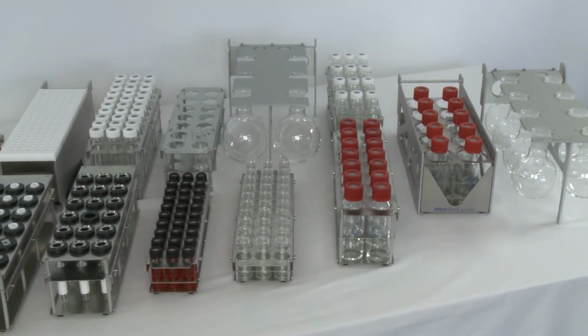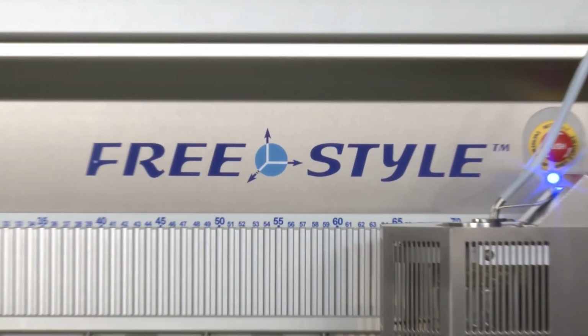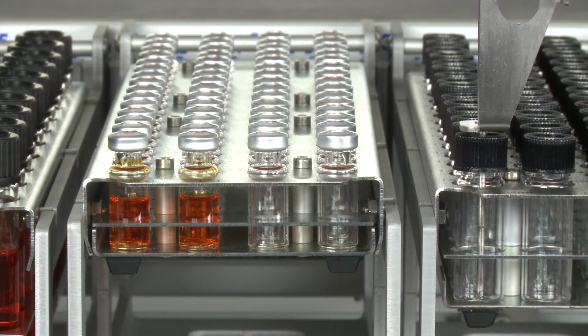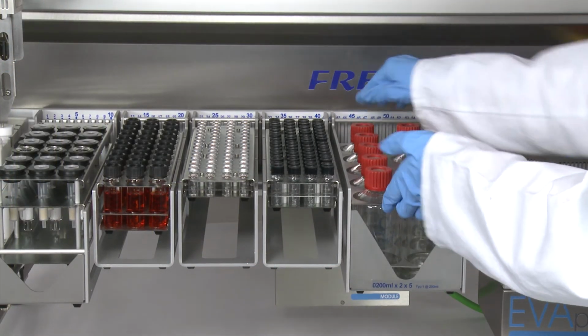Some competitors advertise 50 or more platforms. FREESTYLE has got only one on which you can freely combine all racks available. The racks are fitted in no time and are logged into the software with only a few mouse clicks.